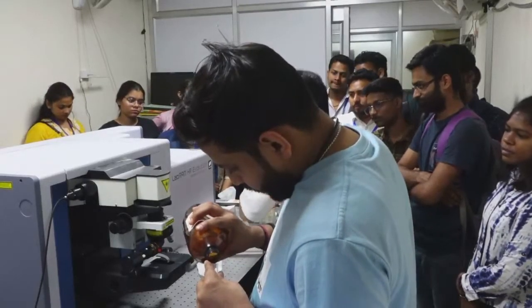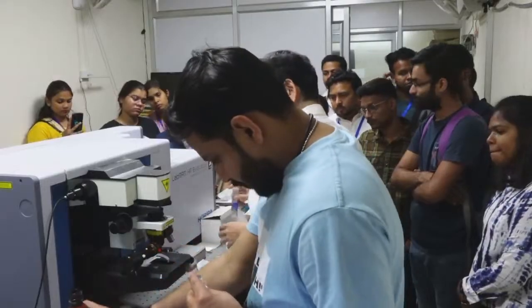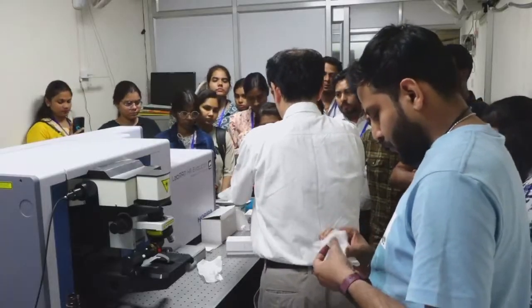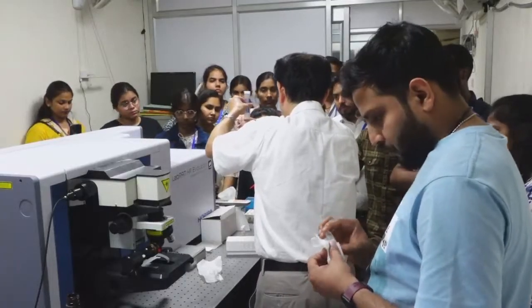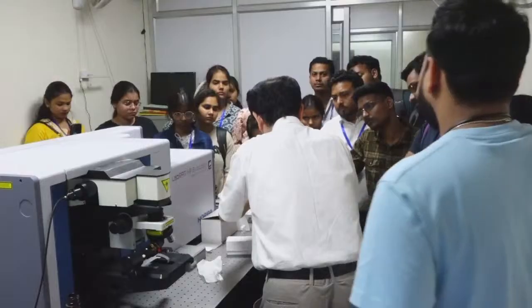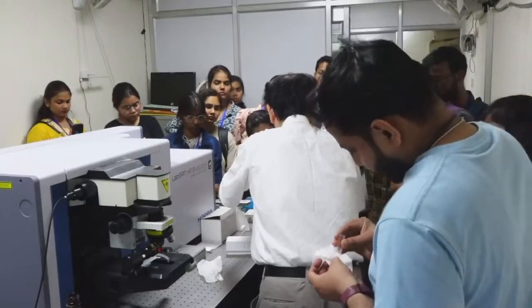How about in this case? This is a Raman microscope. So here is a microscope objective. The laser line comes from the top of the microscope objective, and this objective focuses the light onto a small spot. Then the small spot irradiates the surface of the sample. Then the Raman scattering occurs from this small spot to everywhere.